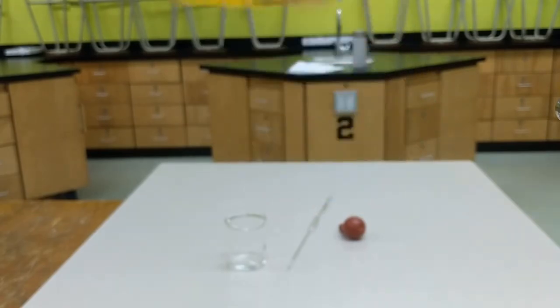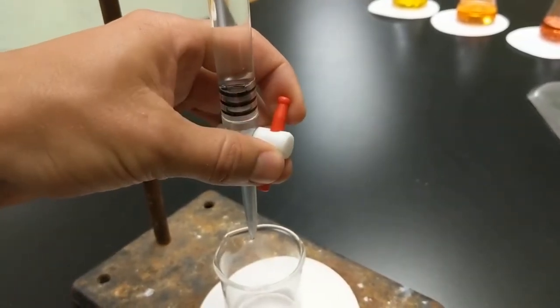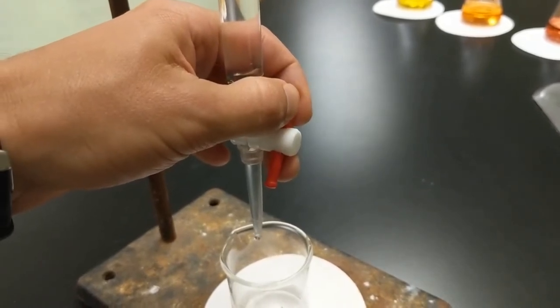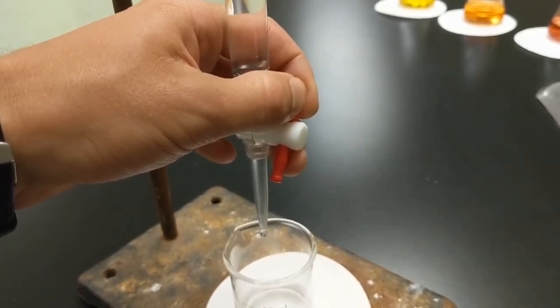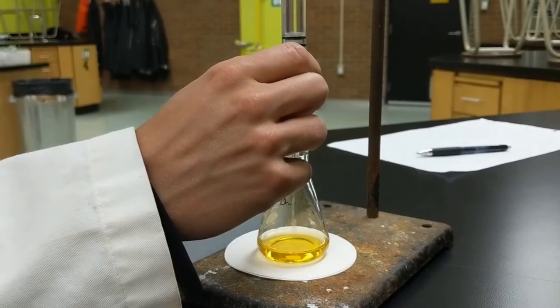Here I'm demonstrating how the tap works. If it's horizontal, nothing will come out; the more vertical it is, the more will come out. Just small movements will change the flow rate, so you can see there's just barely a drop coming out.